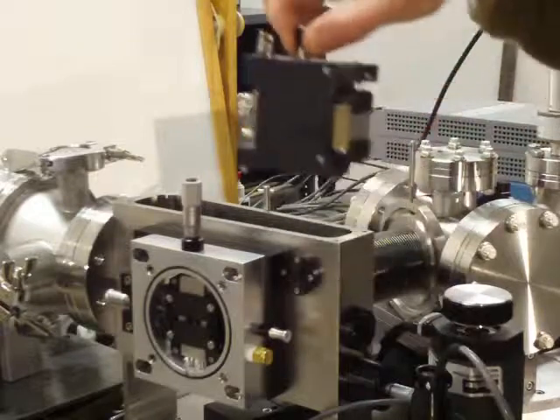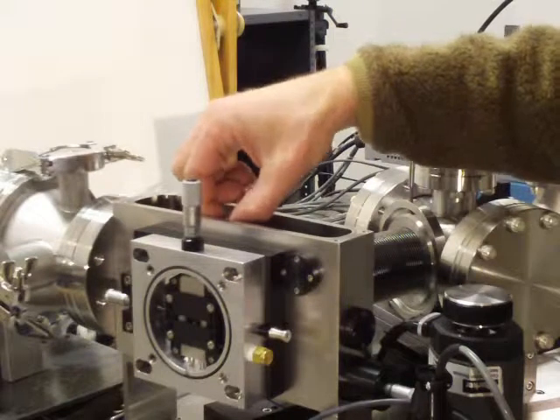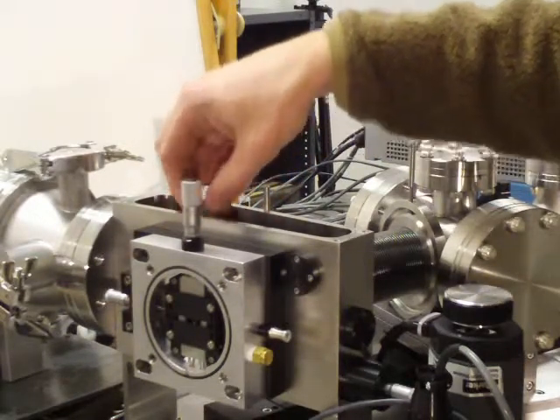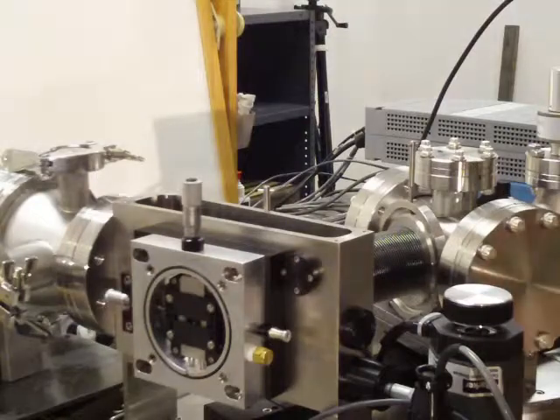Hold the friendly knurled knob up on top of the central mount. Drop the grating inside. There's a three-point kinematic mount there. You hear the solid mechanical engagement. Tighten that knurled screw on top. That's finished.